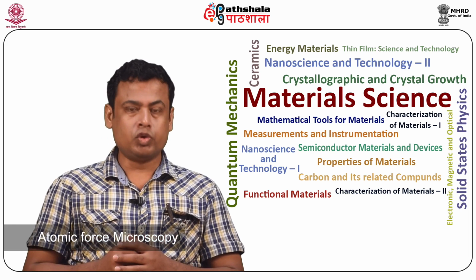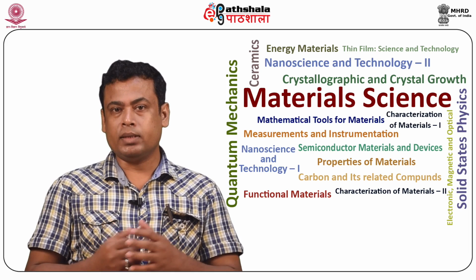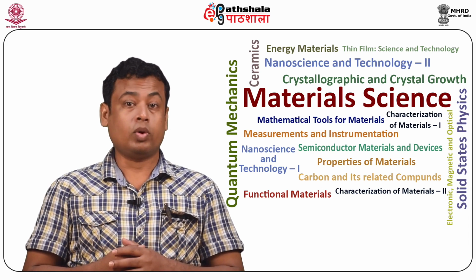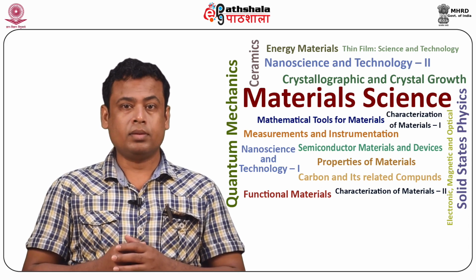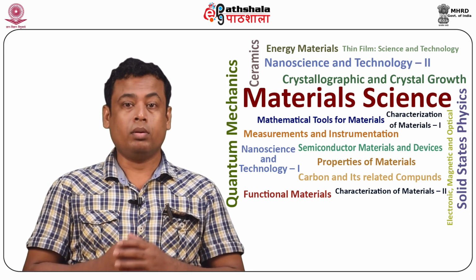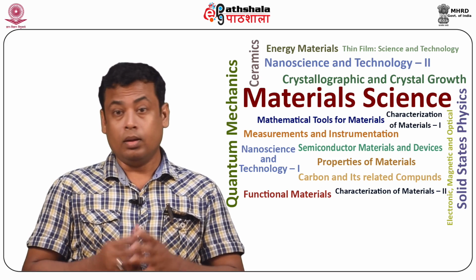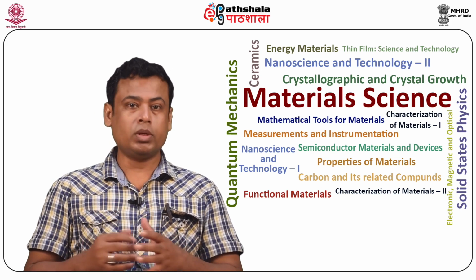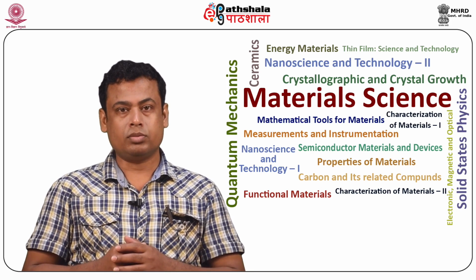Atomic force microscopy includes various methods for detecting the interaction of the probe and the specimen that help to characterize various material properties. In this context, AFM can characterize mechanical, electrical, magnetic and optical spectroscopic properties. In this article, I will explain in detail the different modes of operation in AFM and kinds of AFM systems.